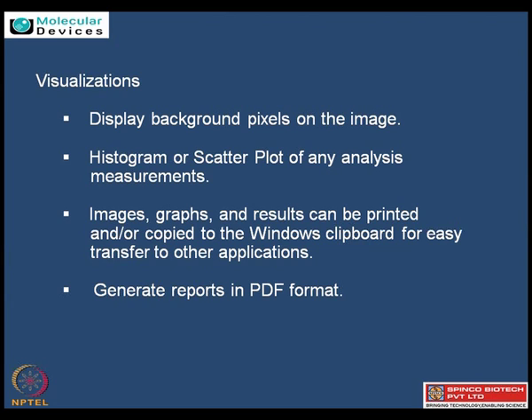So let's talk about visualization, like how one can really generate a good image which can be further used for analysis. Once the image has been acquired, immediately the scientist wants to know how my data has performed. You have given a very beautiful talk on how the controls work, and especially a few people even use bacterial controls, which are non-related to the biology as such. They want to see just the assay controls, so first they check whether my assay has worked or not. The best way for them is looking at the graphs which show differentiation in the level of backgrounds, and this can also be done with histograms and scatter plots.